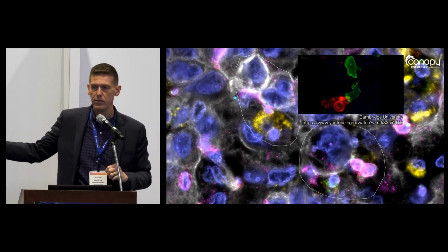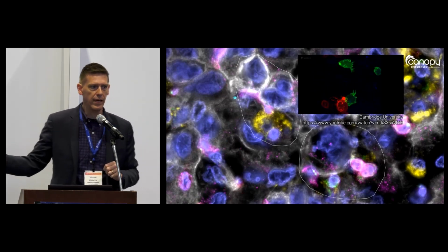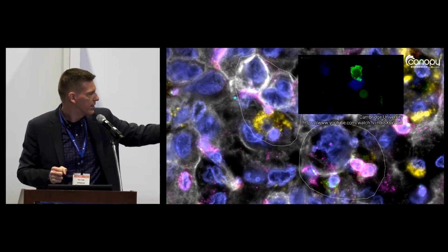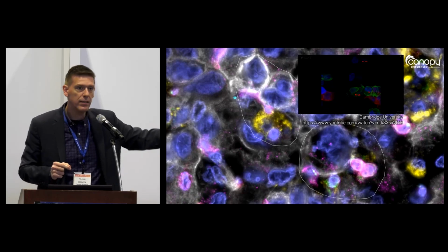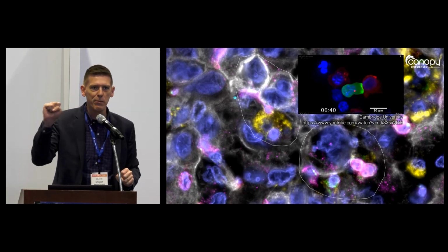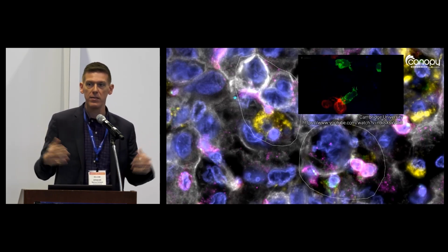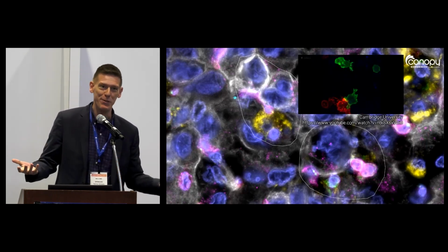When we compare that to the T cells on the right, we clearly have a very sad cell here, with its nucleus highly disorganized, and it's interacting with two other T cells. Those T cells are balled up though. So I would suspect that those T cells are inactive. Something's suppressing them, maybe immunosuppressing them.